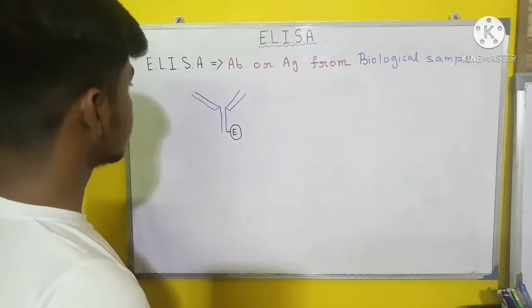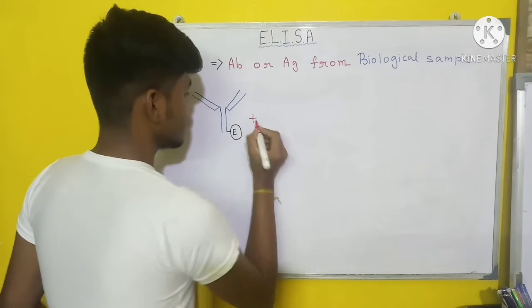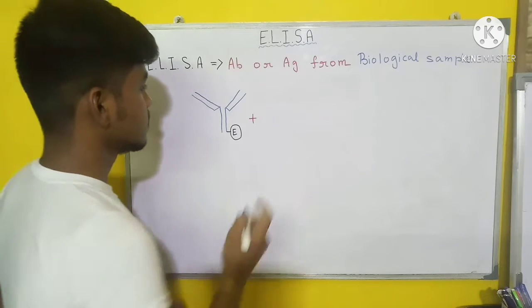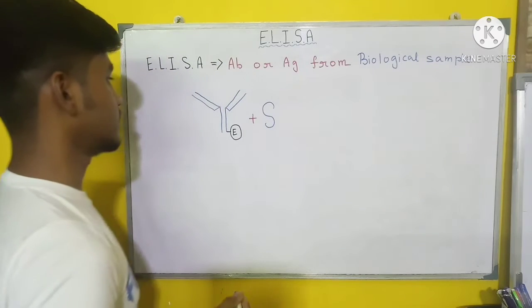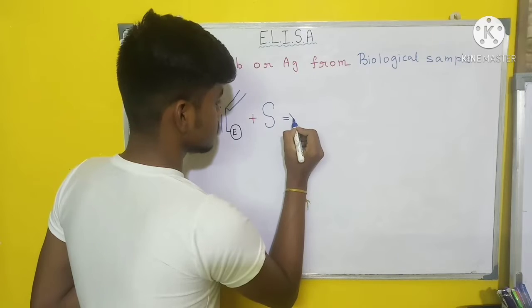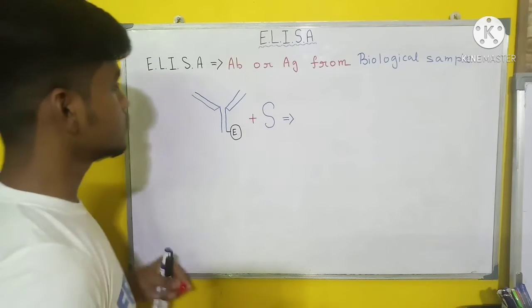This enzyme linked antibody reacts with a substrate, and after the reaction they produce color.